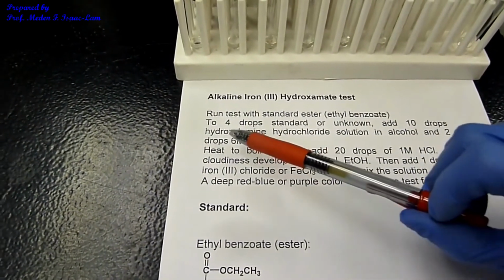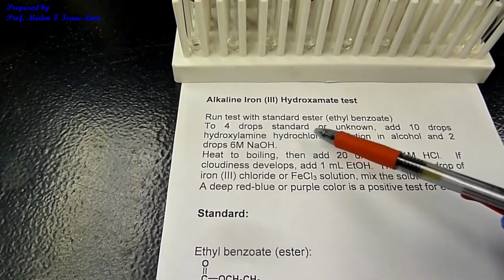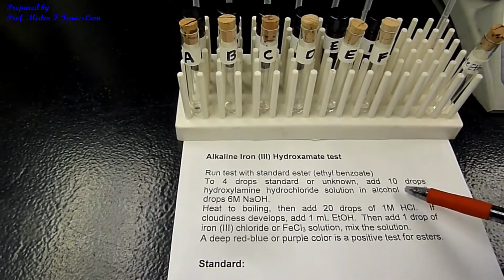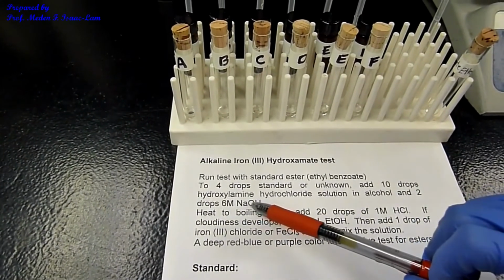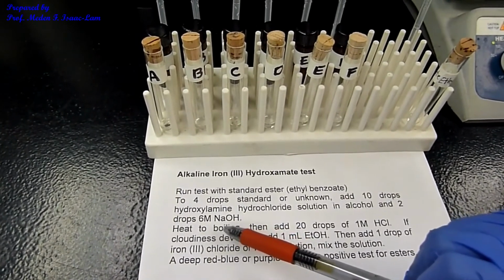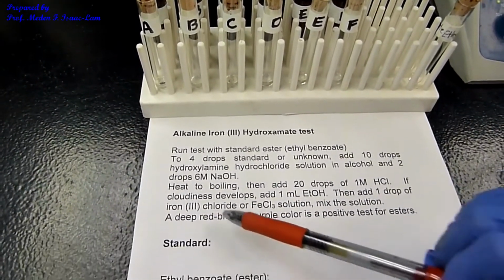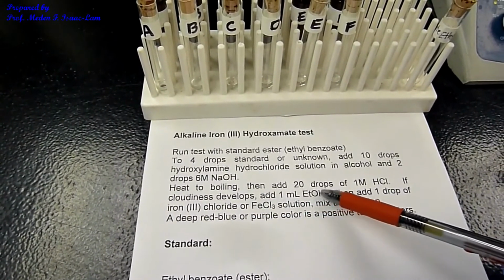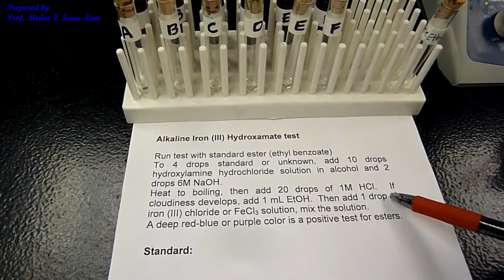And then we are going to put 4 drops of each of the standard or unknown in each of the tubes, and then we're adding 10 drops of the hydroxylamine hydrochloride solution in alcohol, and then 2 drops of 6 molar sodium hydroxide. We're going to heat it to boiling for about 5 minutes, then add 20 drops of 1 molar hydrochloric acid.